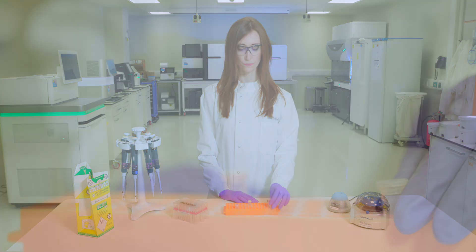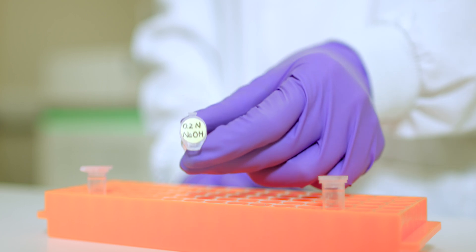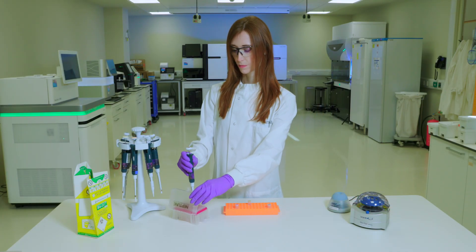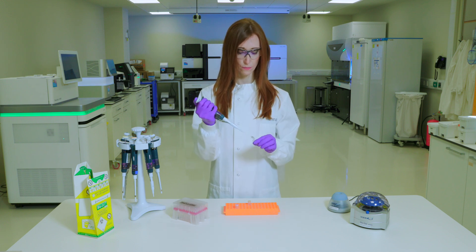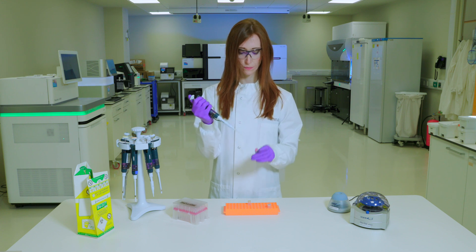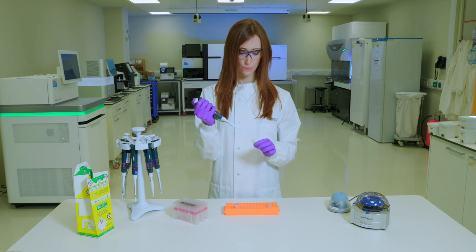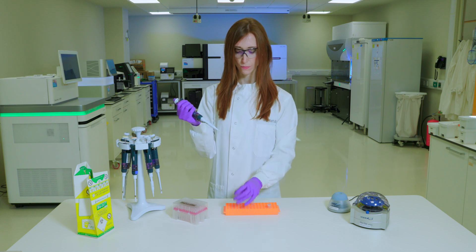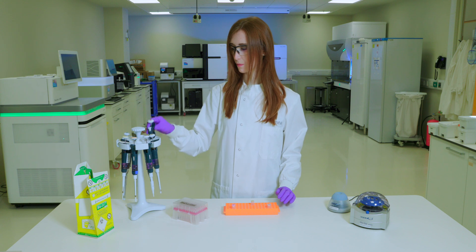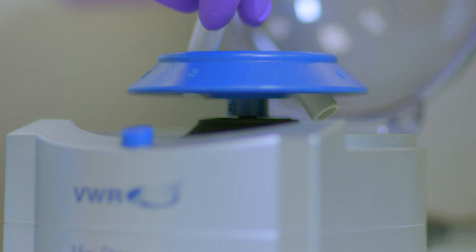We will denature and dilute the libraries starting from a library pool that has a 4 nanomolar concentration. To denature the library, we will use the freshly diluted NaOH. Combine 5 µL of library with 5 µL of 0.2 normal NaOH.